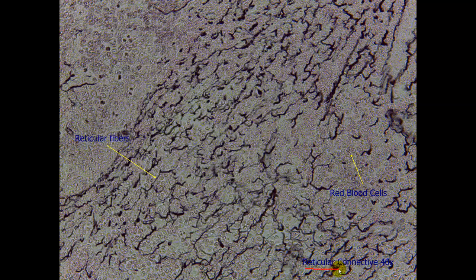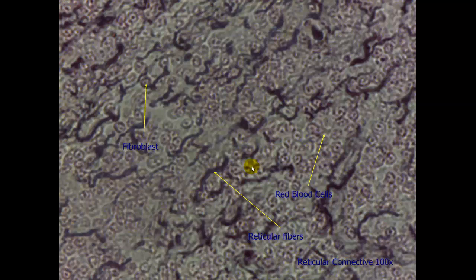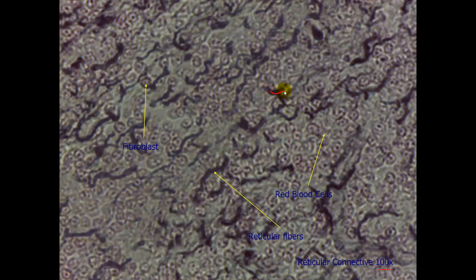Here is reticular connective tissue. This is a 40x magnification. The reticular connective is defined by the reticular fibers that you can see within it. These are the reticular fibers here. Each of these black lines is a reticular fiber all through this slide. We can see red blood cells that are contained within. Again, this is a slide section of a spleen. Here is a 100x magnification of the same. We can see the fibers running all the way through and the red blood cells themselves, and a fibroblast that creates the fibers.